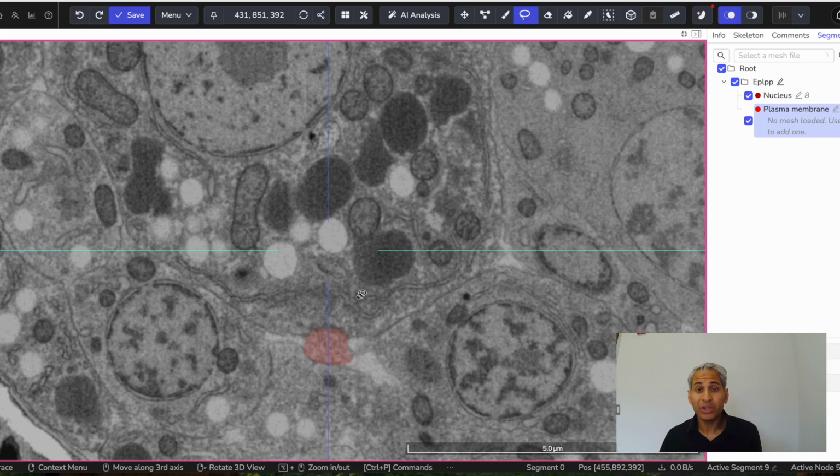Now, you're not going to do the entire cell because that's a lot of work to manually trace the boundary of your cell without using the quick select tool. So let's do portions of your cell this week. And then as we move forward, every week you can do a couple other portions, especially for the regions that you're not sure about. This week, you should do about 10 tracings and use interpolate in between them. And if it gets it right, keep it. If not, undo it.